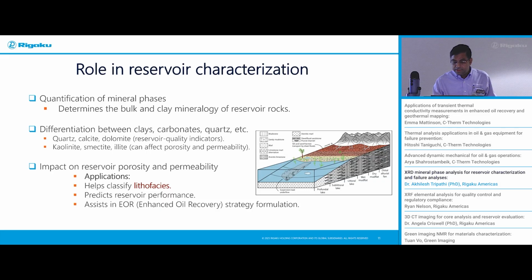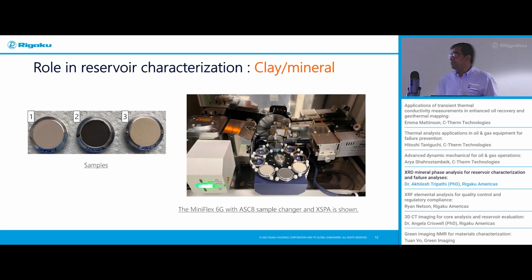So for this, the idea is, for example, you bring the sample from the reservoir, such as a clay and mineral mix, and you can put it in. This is, for example, a picture of the Miniflex inside. You have 8 samples. You can prepare the samples. XRD sample preparation is quite straightforward. You have powder sample, you pack them well as shown here. You can put them in and you can analyze them.